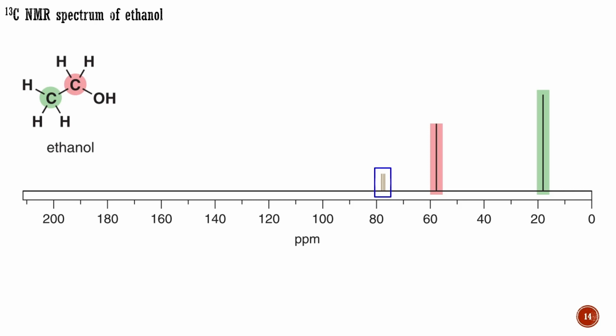The peaks at 77 ppm, shaded brown, are those of the usual solvent, deuterated chloroform, and can be ignored for the moment. I will explain them in the module devoted to further details of proton NMR spectroscopy. When you look at a real NMR spectrum, you will see that the scale does not appear to be in magnetic field units, nor in frequency, nor yet even energy units, but in parts per million, ppm. There is a very good reason for this.